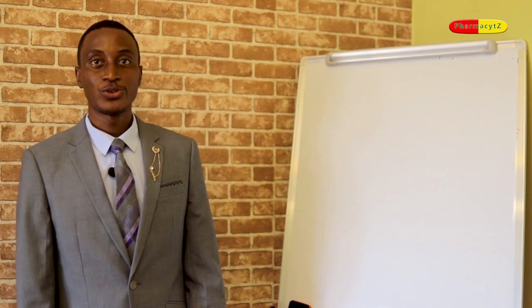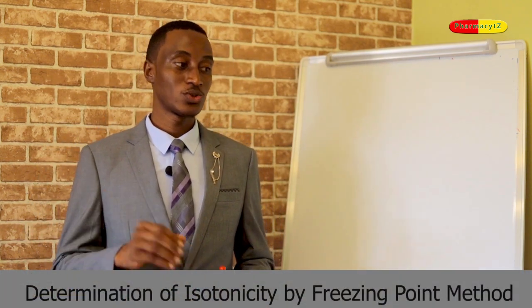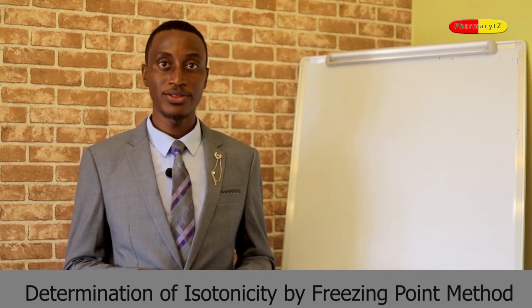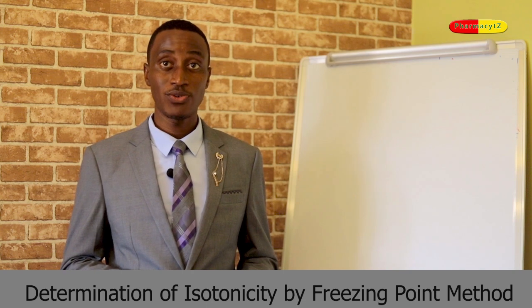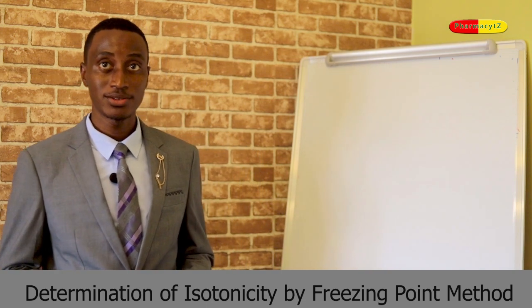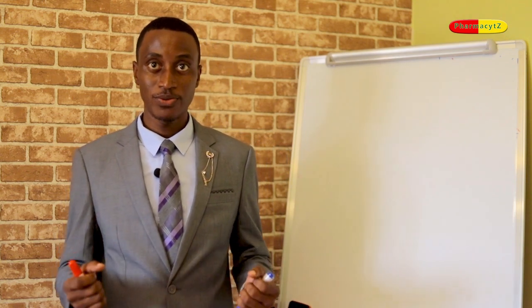All right, today we are going to continue with the next session, especially in PST5, about determination of isotonicity by freezing point method. As you know, it is very important to determine isotonicity before administration of any fluid into the body. This is because of the consequences of administering paratonic fluids. Paratonic fluids are fluids which are not isotonic with body fluids.